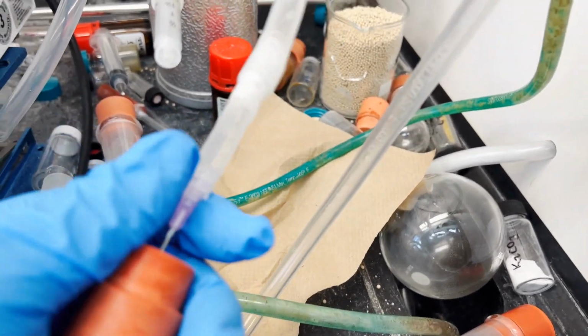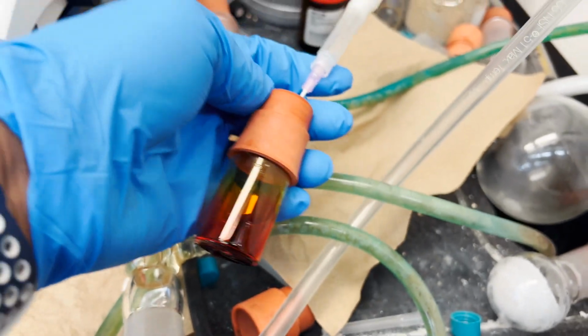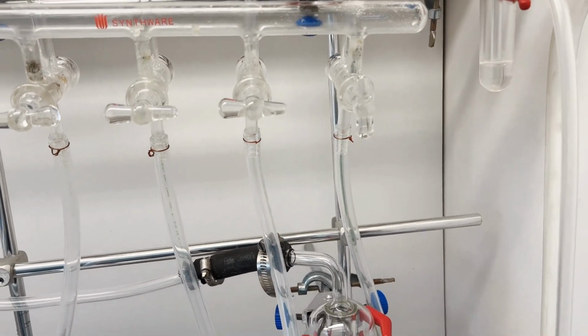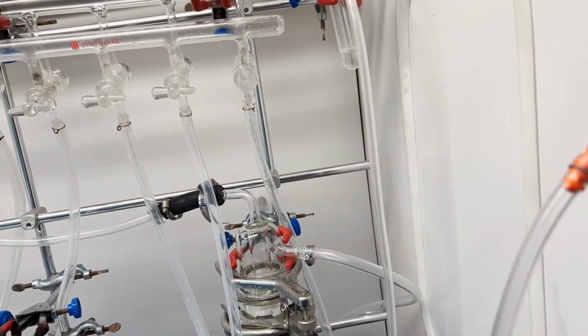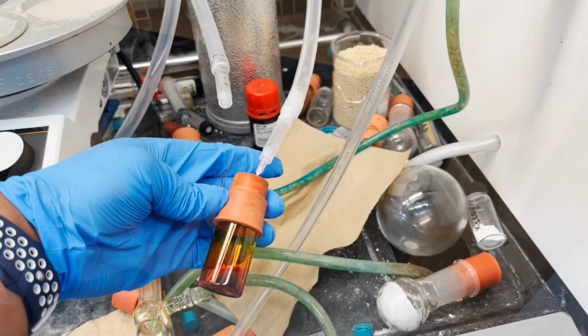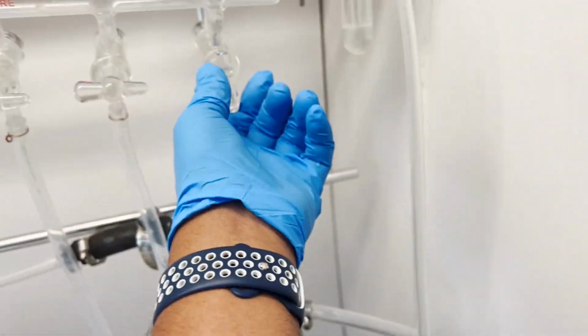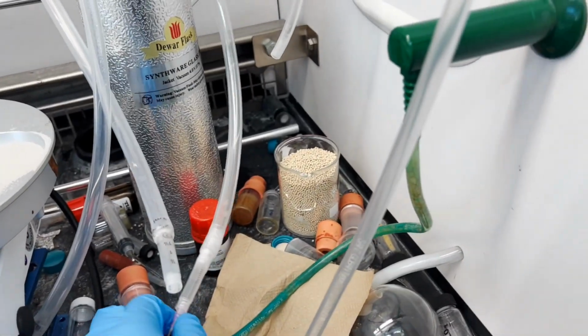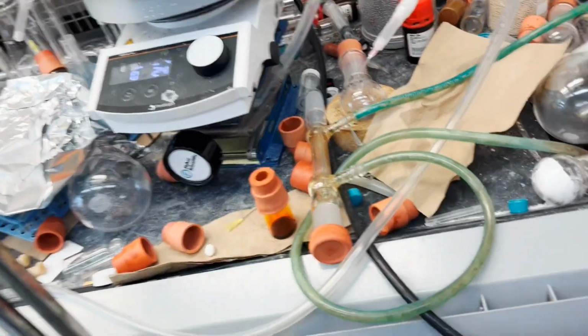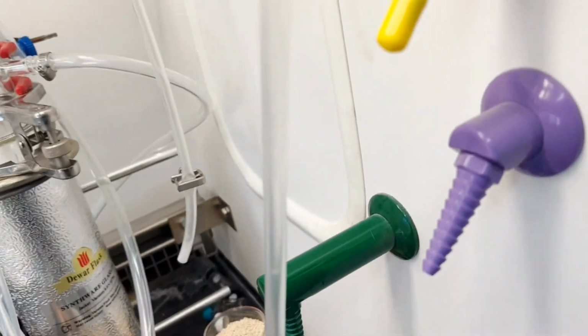Once it is dried, then I will start thinking of purification. There are a couple of things you need to remember. You cannot use silica gel to purify your compound. So it is done, and I'm taking out my crude. What I was saying is, you should not use silica gel.